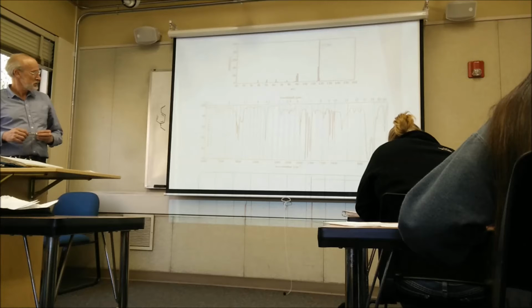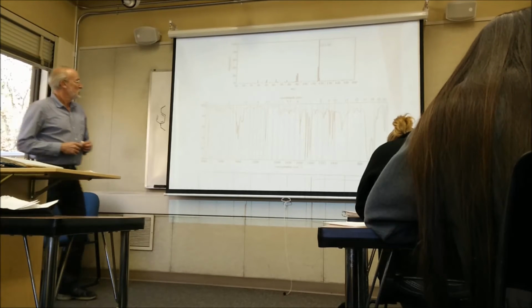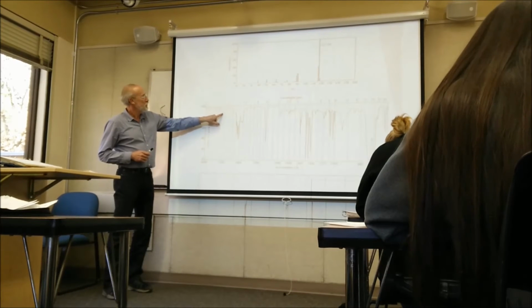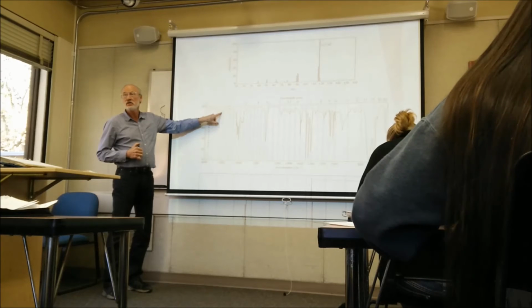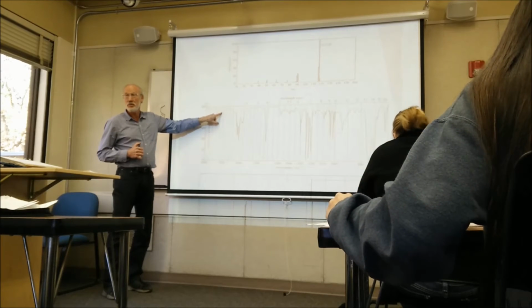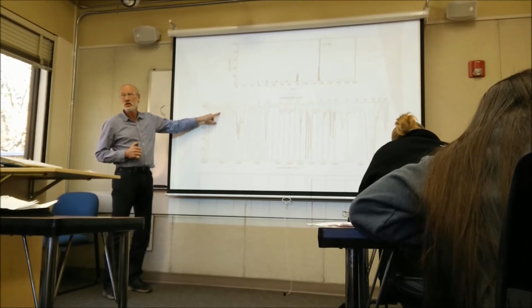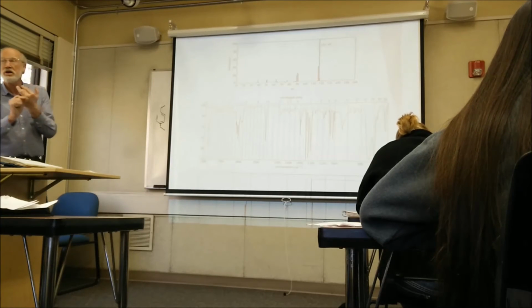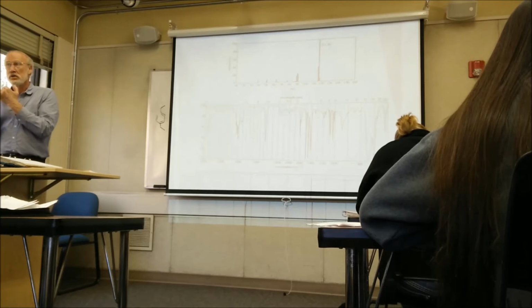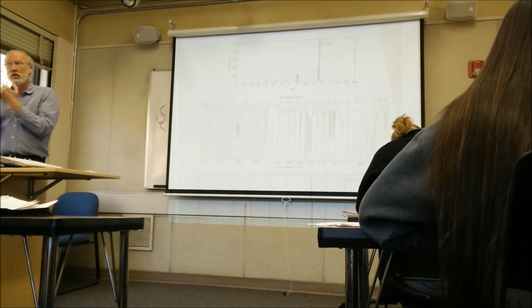We voted. Did we decide on the chemical? No, we haven't yet. It's got a nitrogen. We should have an NH stretch up there. And there's 2 little things, so it's an NH2 group, a primary amine. That's just that 101. What else can you say? Okay, if we take away the extra hydrogen from the nitrogen, we have 102. And if it's an NH2, we're down to 101.